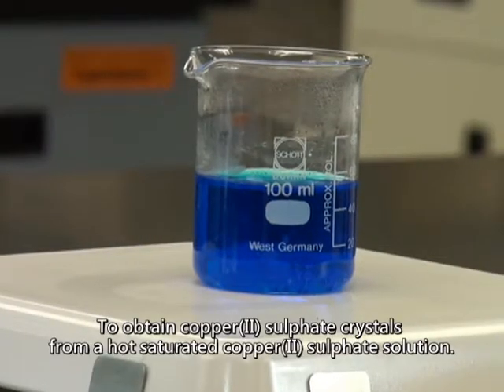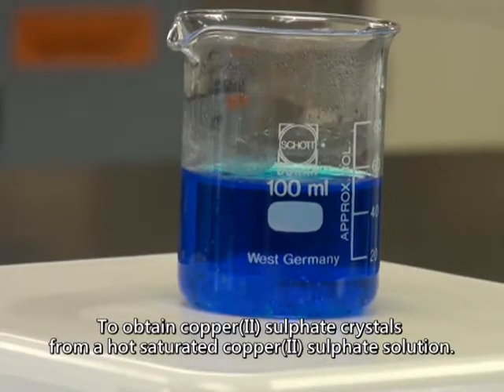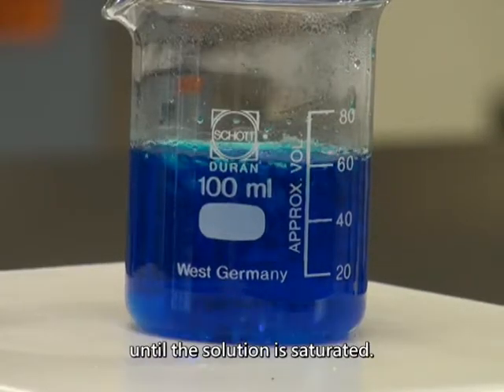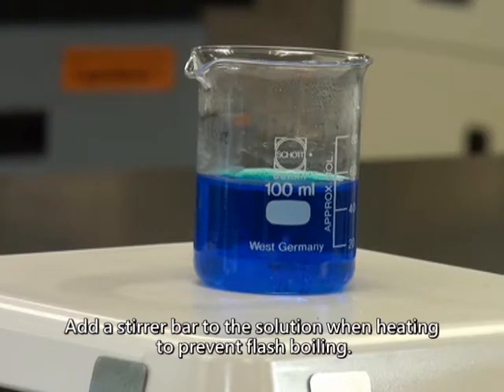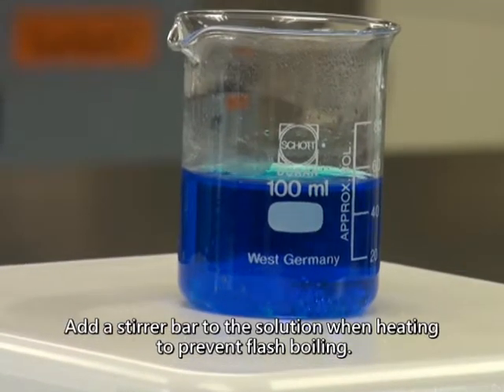To obtain copper 2 sulfate crystals from a hot saturated copper 2 sulfate solution, heat the copper 2 sulfate solution to boiling and evaporate the solvent until the solution is saturated. Add a stirrer bar to the solution when heating to prevent flash boiling.